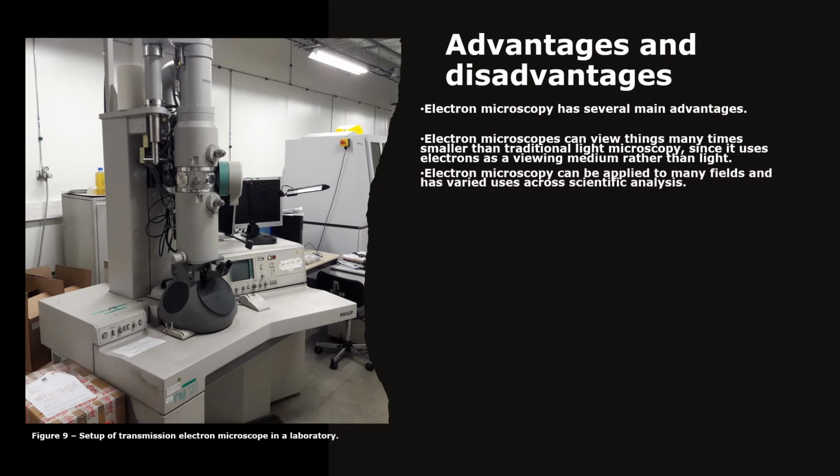Secondly, the techniques have been used widely across the spectrum of scientific disciplines. They can be used for biological analysis of bacteria and uncovering new species. They can be used in forensic analysis on samples obtained from crime scenes. They're even used in electronics in the design, manufacture, and research capacities. Microscopic analysis is becoming more and more important as industry advances and things such as technology become smaller. Finally, provided that the person who is using this apparatus is competent and well trained, extremely high resolution images can be obtained from analyzing the samples, which allows for better analysis overall.